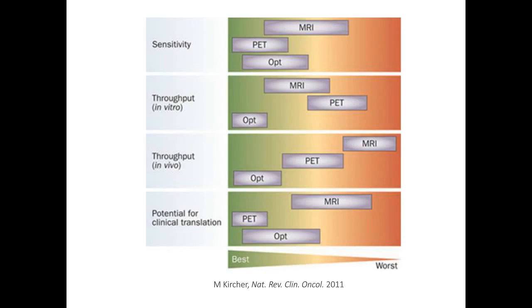In terms of sensitivity, PET does have a slightly higher sensitivity. Optical technically does have higher sensitivity, but because of caveats of detecting light, in general, PET does have higher sensitivity. The last parameter there is the potential for clinical translation, even though here it mentions that PET is the most clinically translatable, MR not being so much, but that's not necessarily true per se, depending on the situation. And for the most part, all 3 of these modalities can be translatable to the clinic in one form or another.